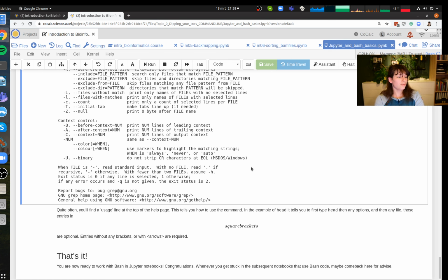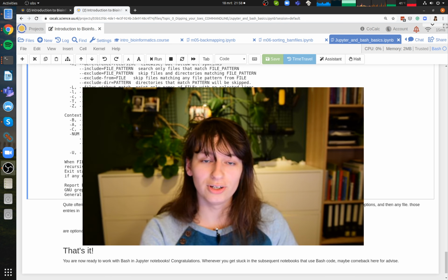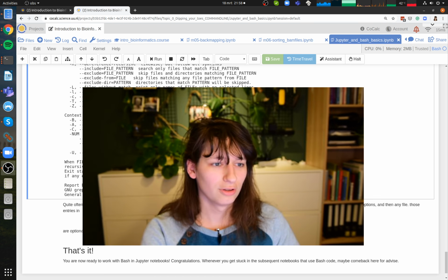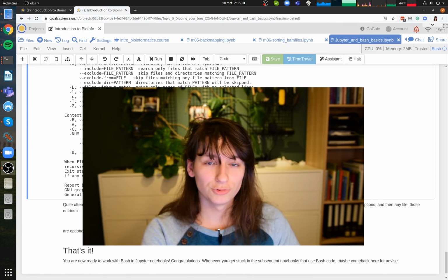If you made it through the entire video and the entire assignment, well done. Perhaps this is all very normal for you. Perhaps it's actually really tricky and you find it very hard. I think from experience, we've done this course a few years now, if you find this very hard, perhaps just try and do it again. I think it's worth your investment to really master this part before you move on. I'll see you at topic number 2, metagenomics, and until then, have fun with all the primers in topic number 1, genomics. See you in a couple of days.